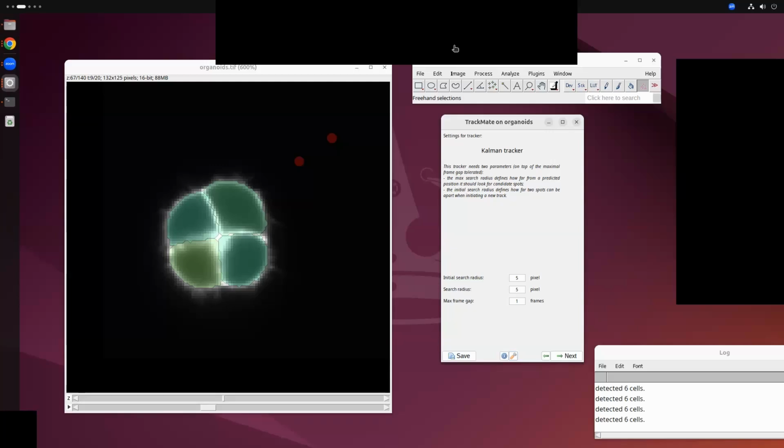And if you need help, just email us. We would be very happy to help you set up your own server. Setting up your own server also has the advantage of a much shorter data transmission distance, so your response time is going to be faster.